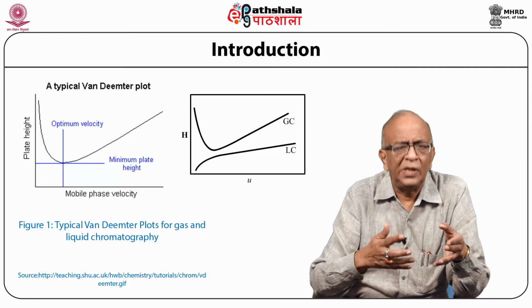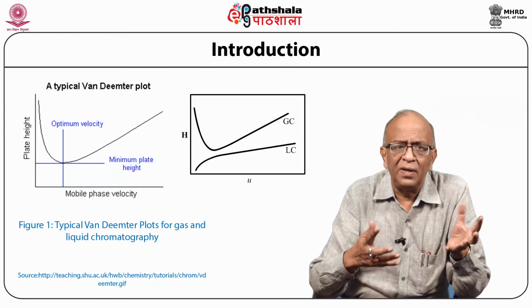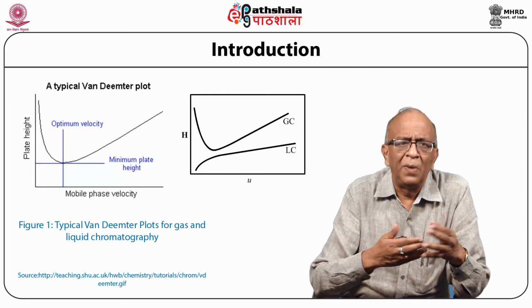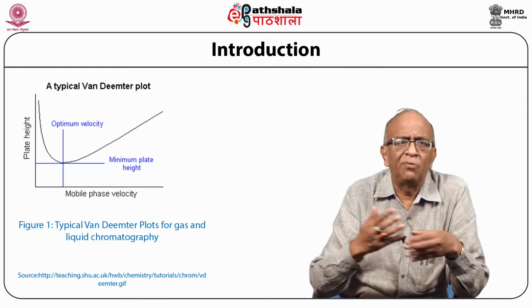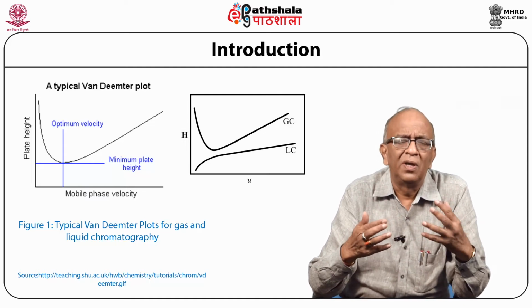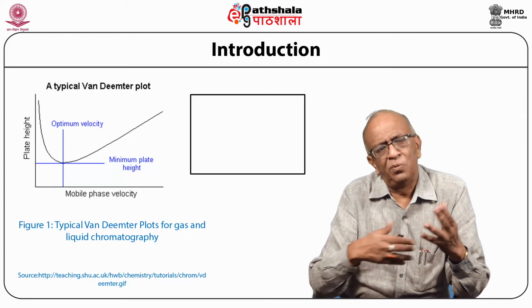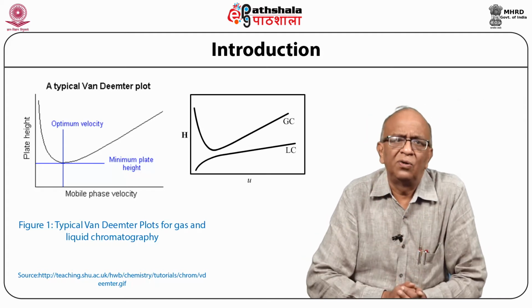But in this lecture, we shall try to understand liquid chromatography by taking the example of high performance liquid chromatography, and gas chromatography by taking the example of gas liquid chromatography, and both the techniques we shall learn in today's lecture.